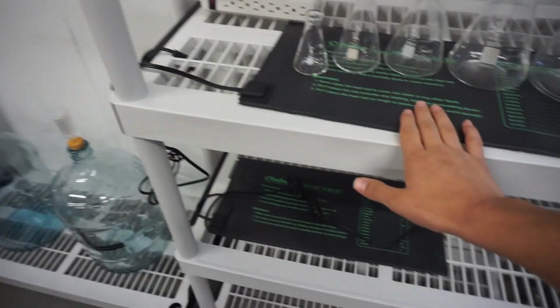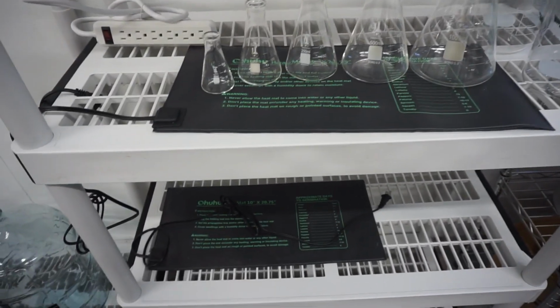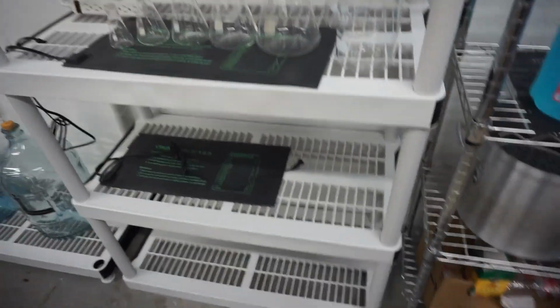Oh, and these little black mats here are heating mats, usually used for germinating seeds. But oh my God, somebody's interrupting me.